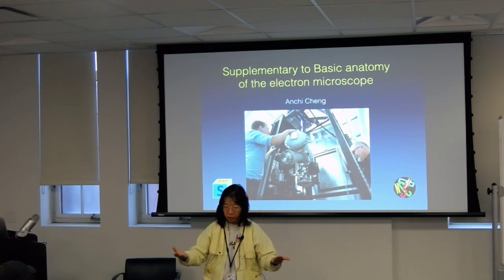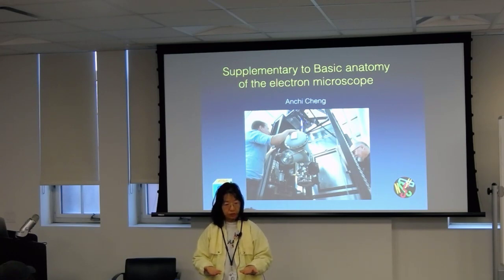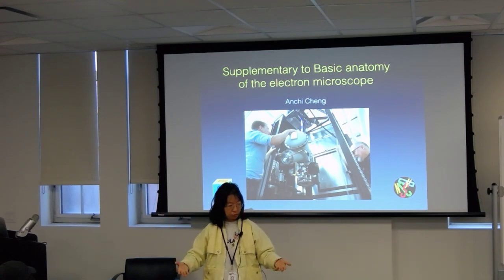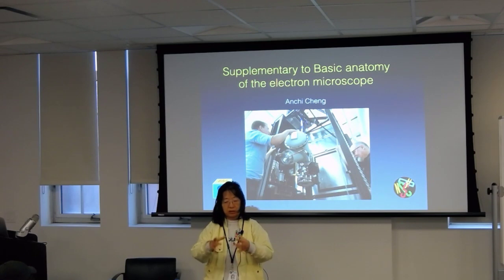And then it will also have aperture, because the lens, no matter how you do it, the edge is still not going to be as good. So you may be using an aperture to give you better contrast or whatever.